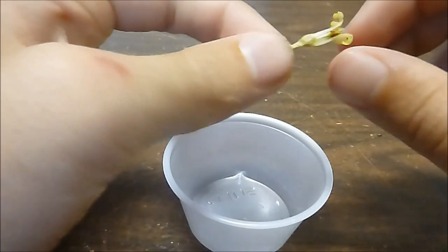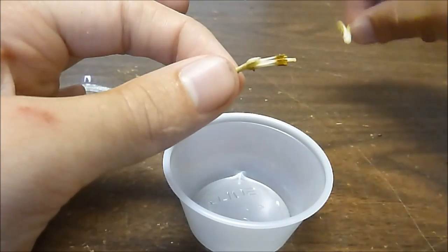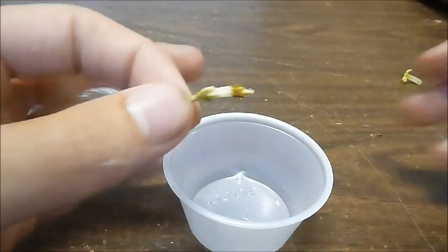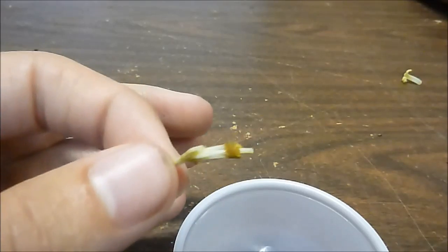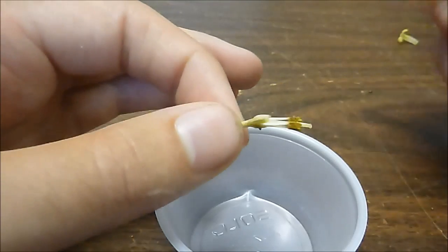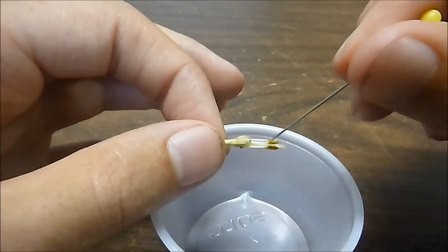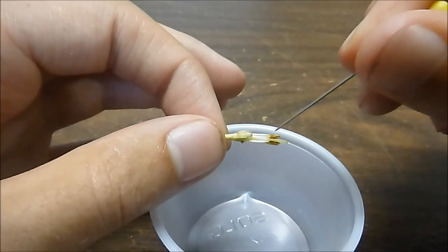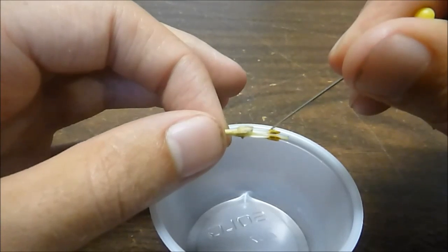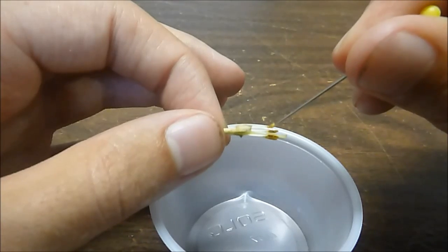The first thing we do is peel back — well, usually we'd peel back, but this specimen is kind of dry — so we just take off the petals, and now we have the anthers visible. And then in between the anthers, there is a yellow line. That's the pollen. So basically, we just run the needle through the yellow line to extract the pollen, like this.